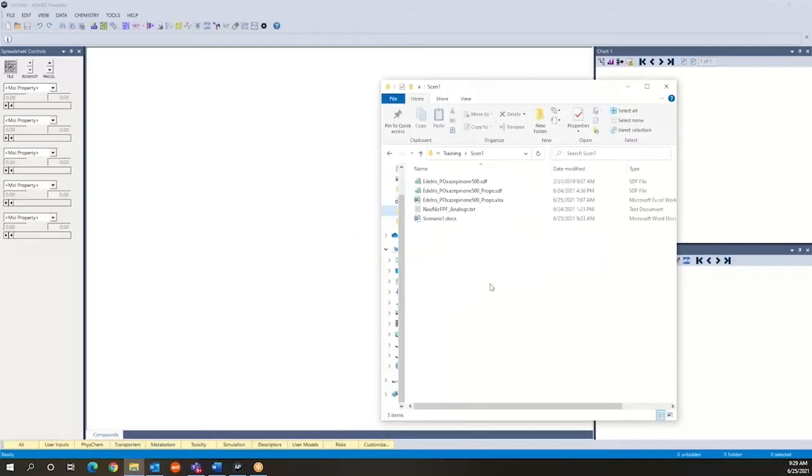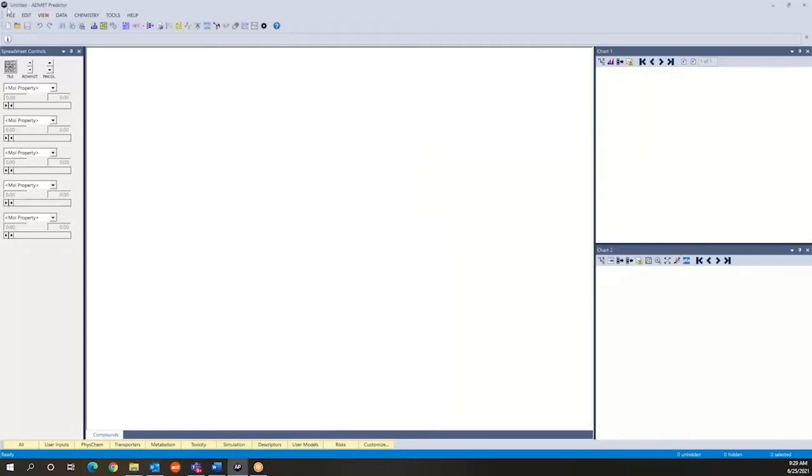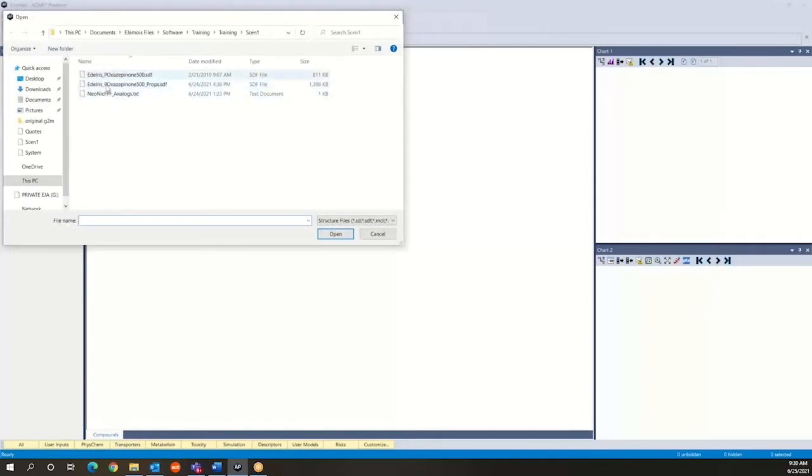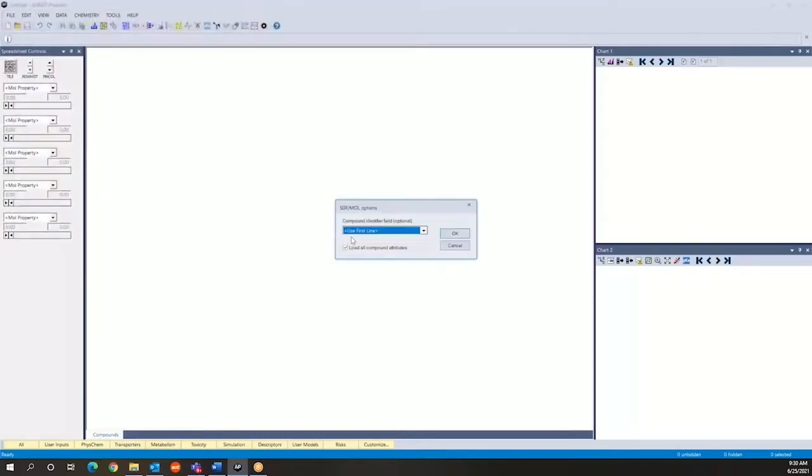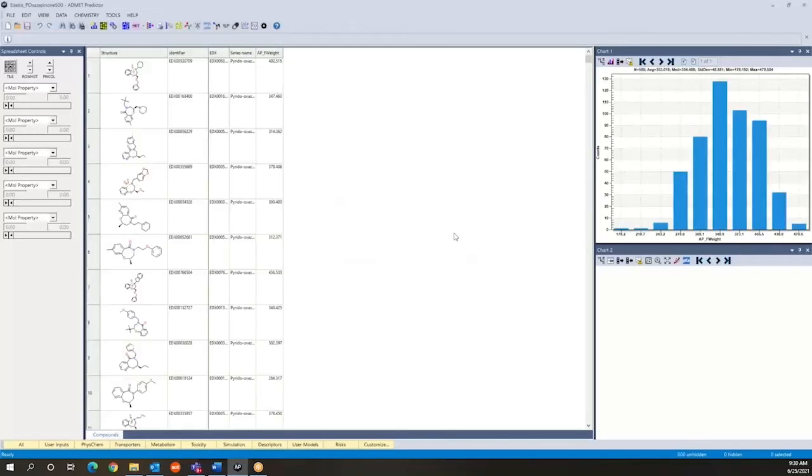The most common type of files containing compound structures are SDF files, and in most cases these contain only structures. Sometimes they contain structures and properties. So here we have a file of 500 compounds of pyridooxazepinones. You can very easily open this file by just going to File Open and selecting this SDF file as the file to work with. Now you have the option to provide the name of the field to be used as the identifier for these compounds. And so here the identifier is encoded in the EDX field, so you can specify that as part of the reading process.